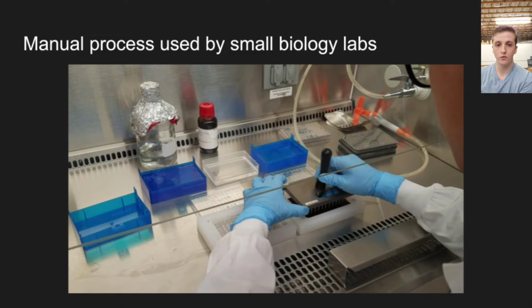There's a manual version of the pin tool, which is what I use, and it has its obvious limitations. Like repeating results and experiments is very hard because every single time you use it, it's a bit different. Also, it's very time and labor intensive.